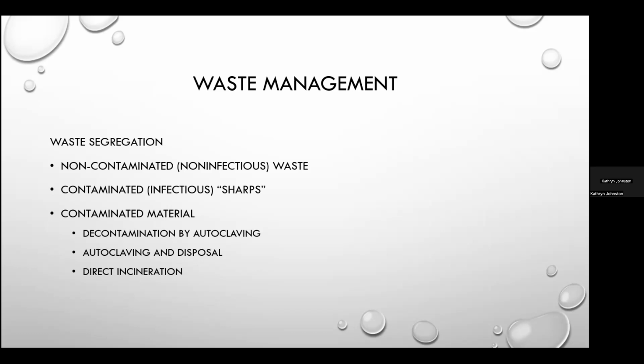So when we talked about standard precautions and cleaning, disinfection, and sterilization, I talked about cleaning as being the first step. In the laboratory, because of high bioloads, they recommend autoclaving or something first, and then cleaning after the biological pathogen has been inactivated.